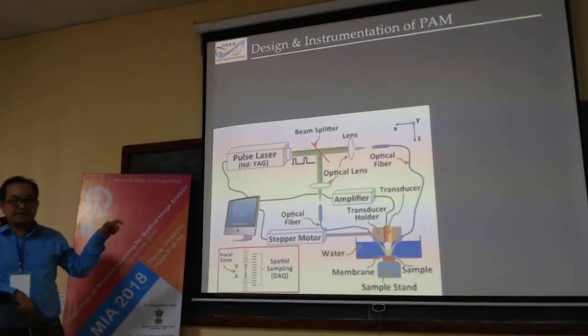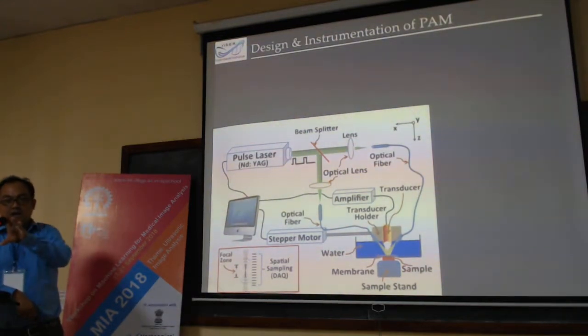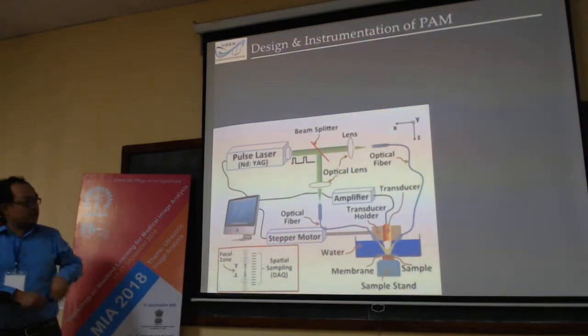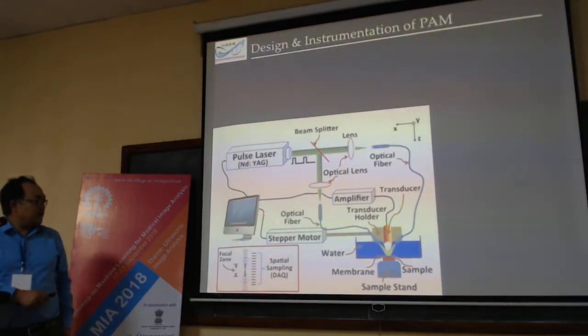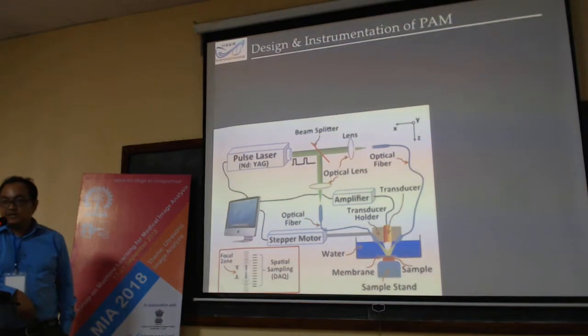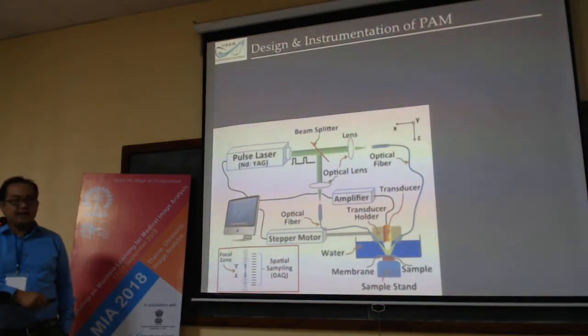So within this range we have to capture the signal, and finish the capturing before the next pulse excitation. So this kind of synchronization is required. In our case, we use LabVIEW to synchronize all these things: excitation, movement, and acquisition and transferring of the data.